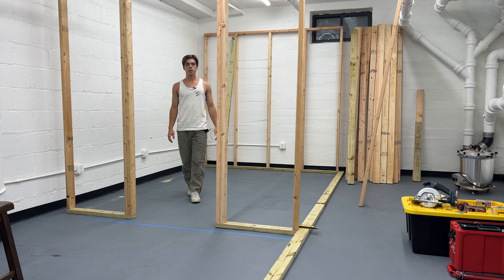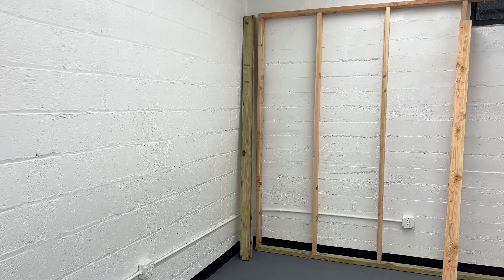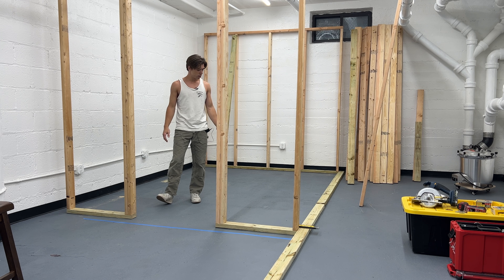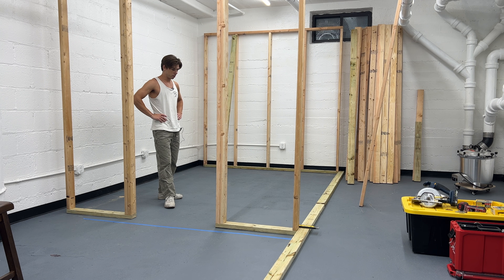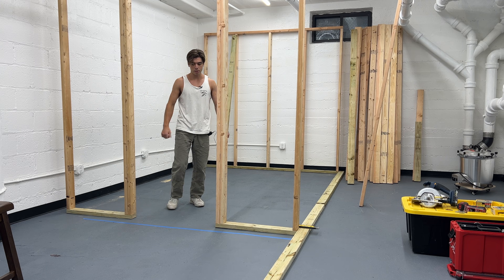Day two of the clean room build. This is what we're working with right now — we got the front wall and back wall framed out. Today we're going to try and get the side walls done. We'll start with cutting the baseboards, then we'll cut the studs, screw it all together, and get this thing assembled. Let's do it.